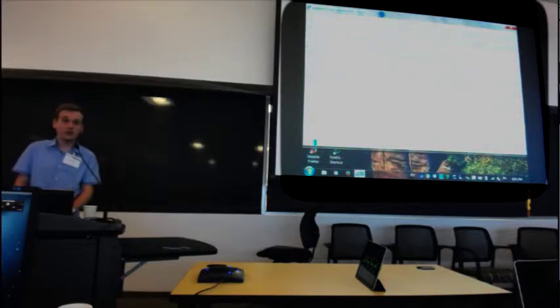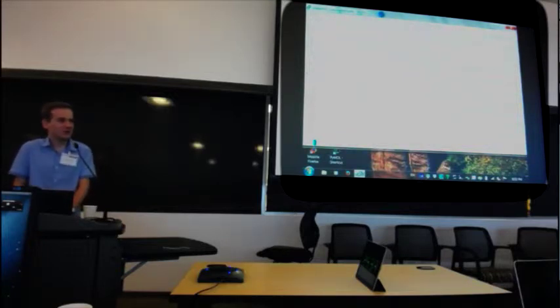So has everybody reached this step? Who has some problems? Getting a wait and check again. It's probably because there are so many jobs pending. I don't know. Let's have a look. It took like 50 seconds or so. So you keep clicking on each check. Yeah. Okay.